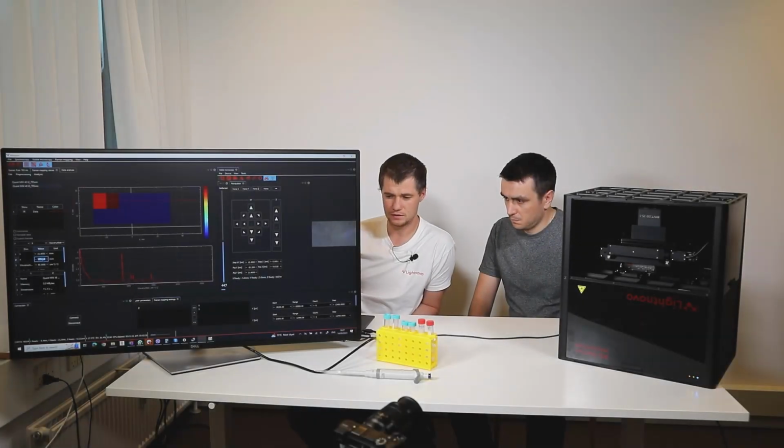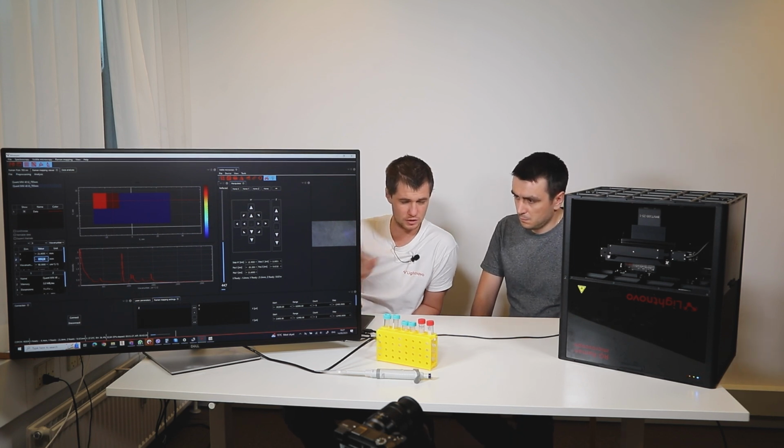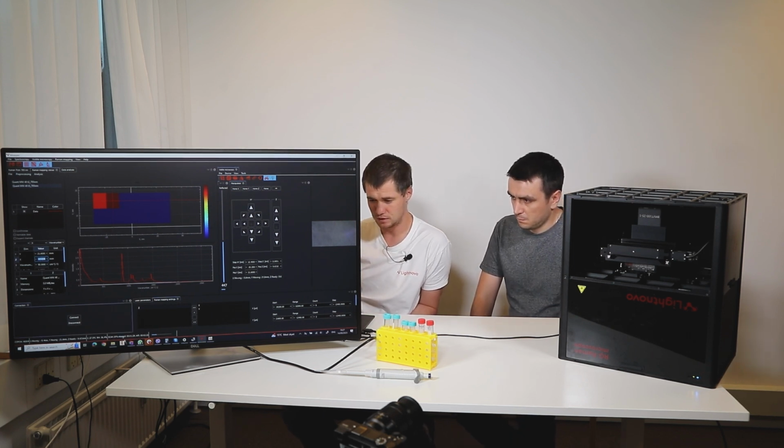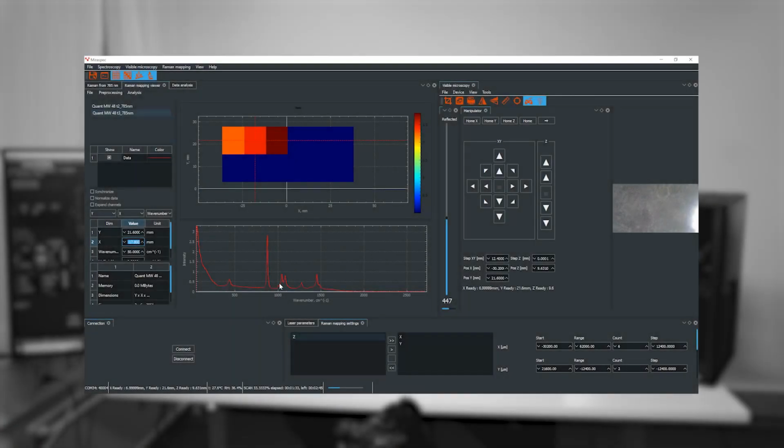And we can see the difference between A1 and A2, it's concentration 0 and concentration 1%. And the methanol peak is supposed to be here, a bit higher than 1000. So you see it's less, then it's higher, and even higher. So the concentration of methanol is growing.